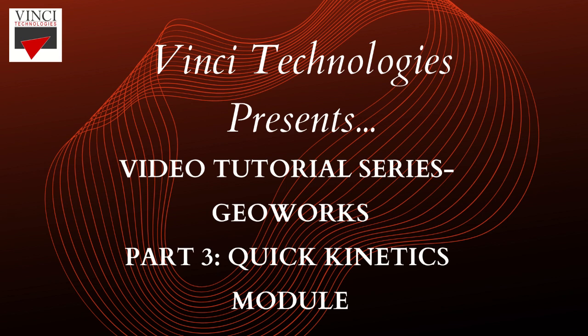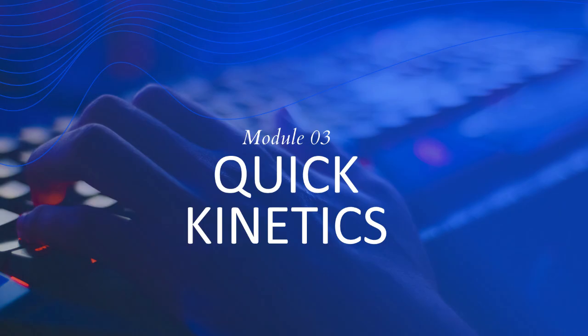Hello, this is the third module in our video series of GeoWorks, the Quick Kinetics module. Utilizing the Tissot-Espitalié model, this module enables the rapid determination of activation energies distribution for S2 and sulfur peaks, which are obtained via pyrolysis conducted at a single controlled heating rate.